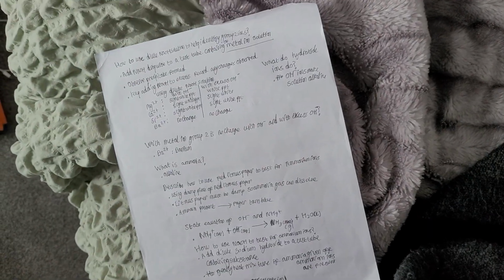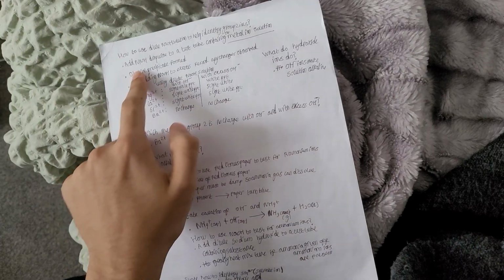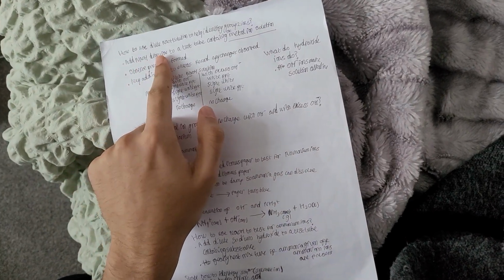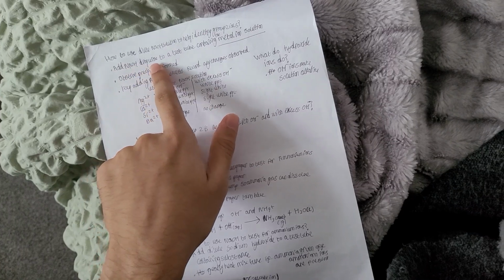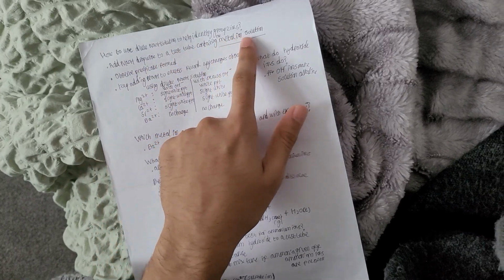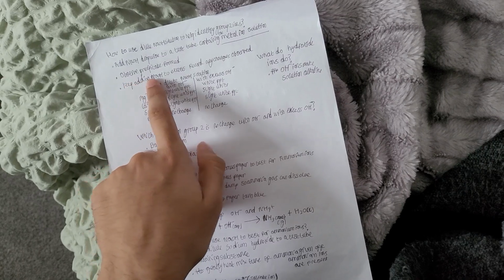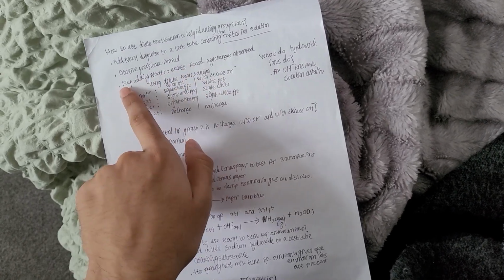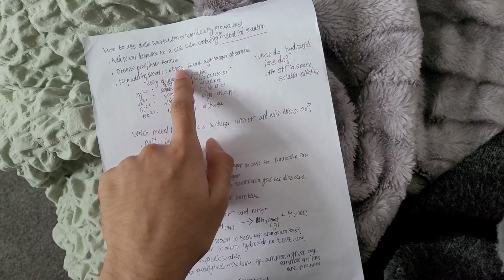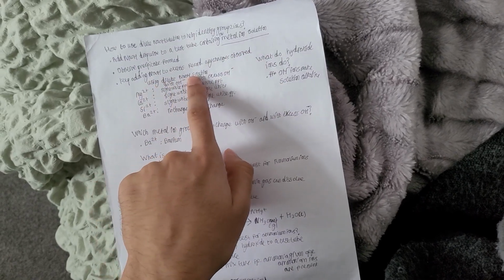How to use dilute NaOH solution to help identify group 2 ions? Well, you want to add NaOH, sodium hydroxide, dropwise to a test tube containing the metal ion solution, and then observe the precipitate formed. Keep adding NaOH to excess, and record any changes observed. And this is using dilute NaOH solution.